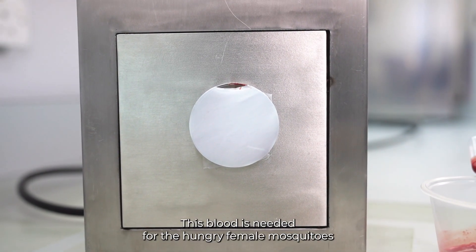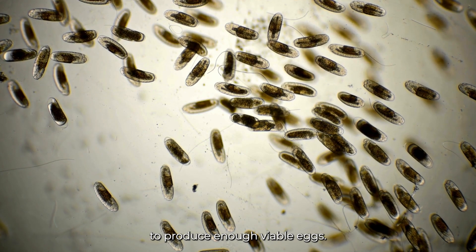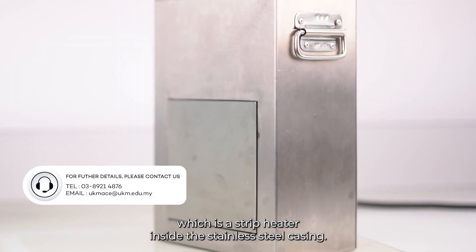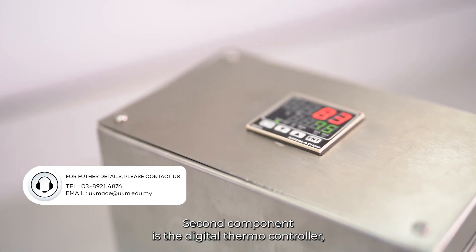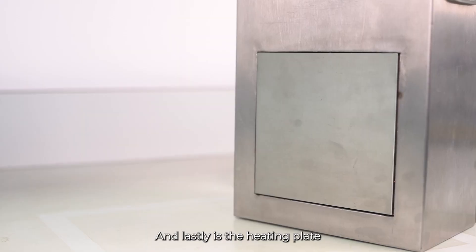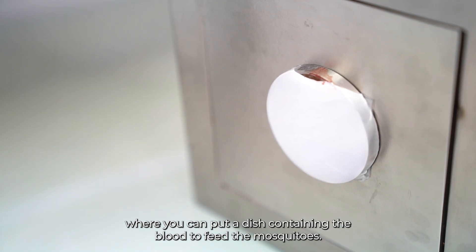DITMOF is an artificial blood feeding system used to heat up the blood. This blood is needed for the hungry female mosquitoes to produce enough viable eggs. DITMOF has three main components: a strip heater inside the stainless steel heat sink, a digital thermal controller which you can set to a constant temperature, and lastly a heating plate where you can place a dish containing blood to feed the mosquitoes.